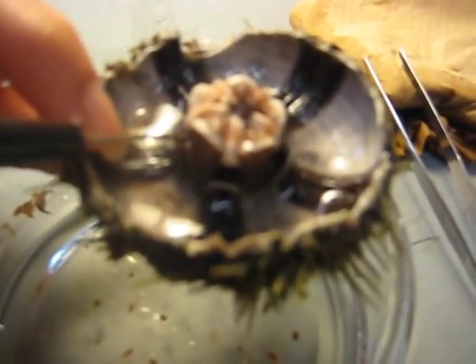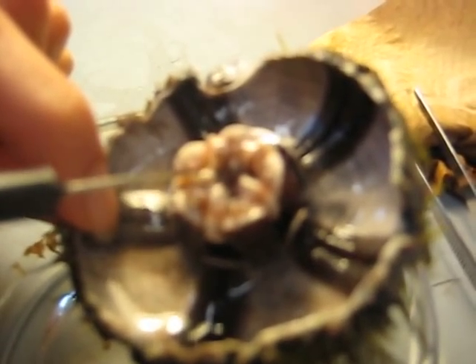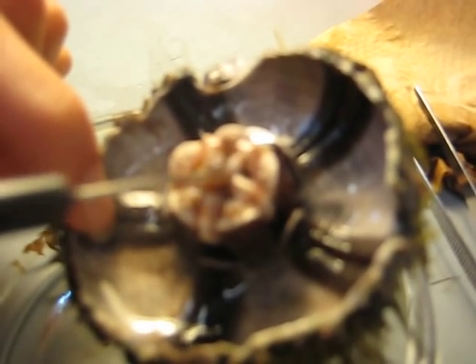This hard part here is the base — the auricula, or the base. And the ring canal is just the part right around the esophagus, the little ring part around it, not the outside area, just the insides here.